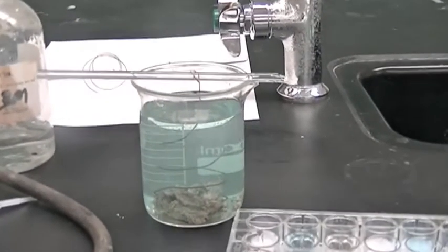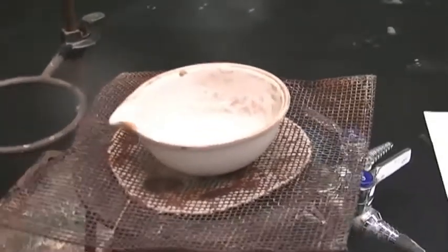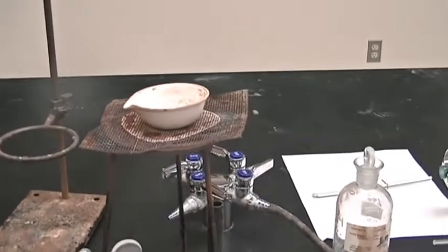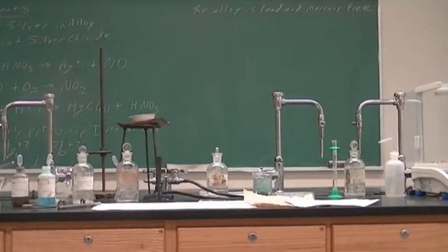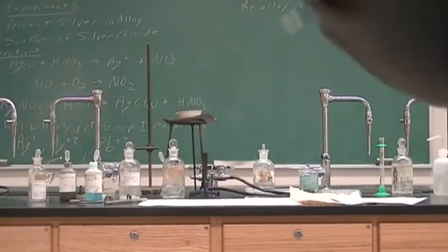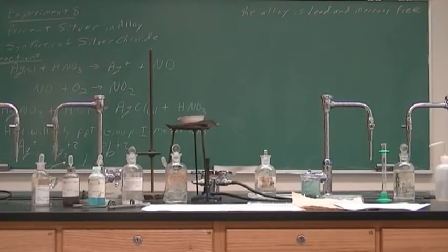All right, so what we're going to do now is get our silver out of this beaker and put it into our evaporating dish. And then after we have cleaned our silver and dried our silver, we will weigh the silver, and that will give us our calculation for percent silver. So I will put the video down. All right, there we are. Hopefully we can see everything. And then we're going to clean our silver. So I will try to show you how you will wash a solution.